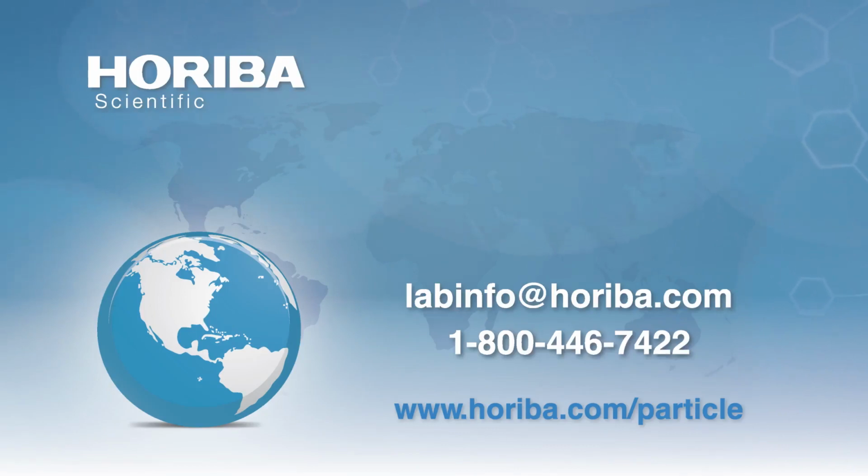So if you make measurements on a very diluted suspension of, say, magnetic iron oxide particles, you can get measurements because modern equipment is very fast. You don't have to do multiple runs to get an average; you do many, many single runs and average them. You can get quite a reproducible value, even though if you wait long enough, the particles themselves will aggregate.